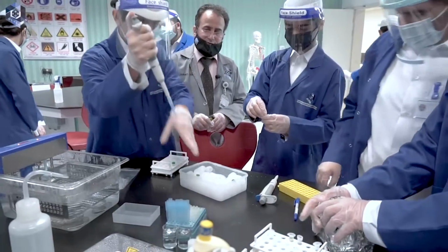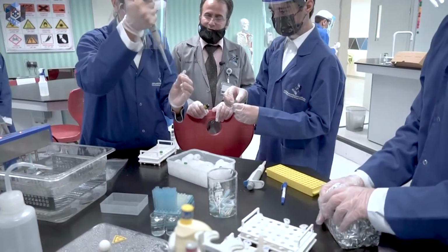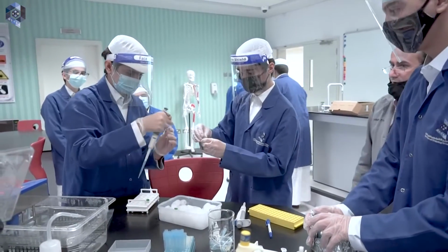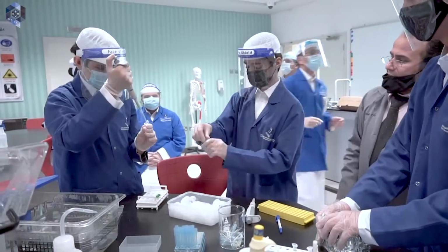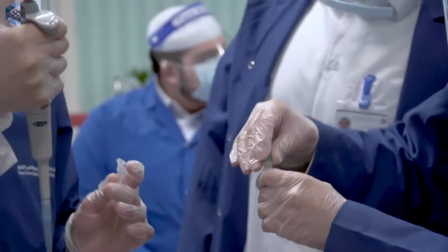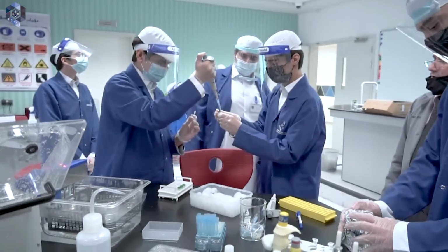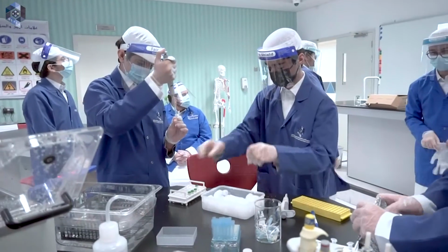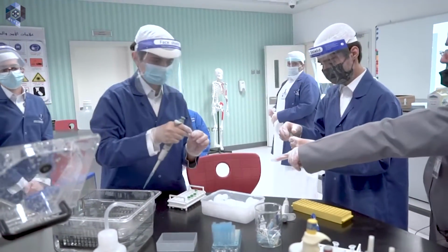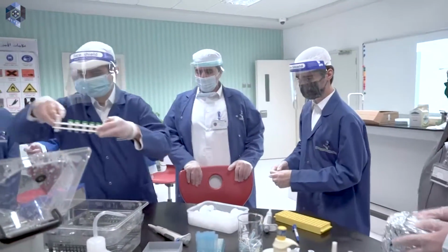The other one. Good. The same one? Yes, the same. Okay, good. Good, close. Close it. Now put the test tubes in the water bath at 37. Put it in water bath at 37. 10 minutes.